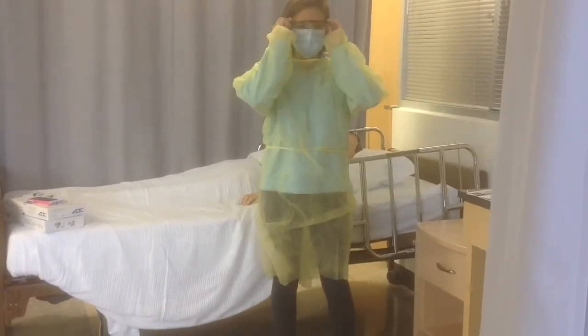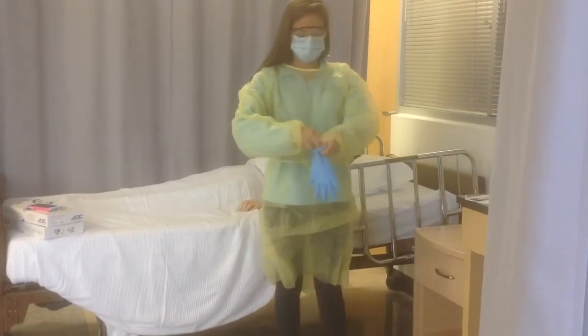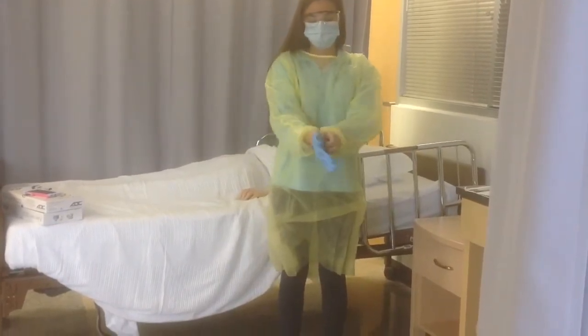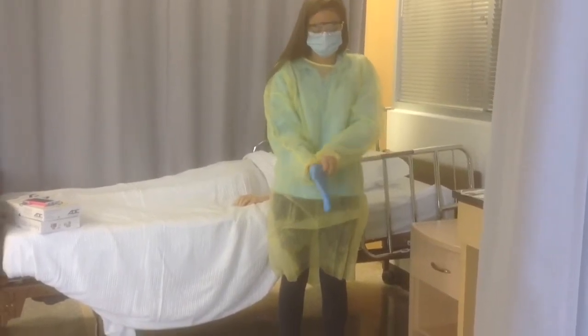Take your goggles and put them over your mask. Get your gloves that are the correct size and put them on. Make sure they are over the sleeves of your gown.